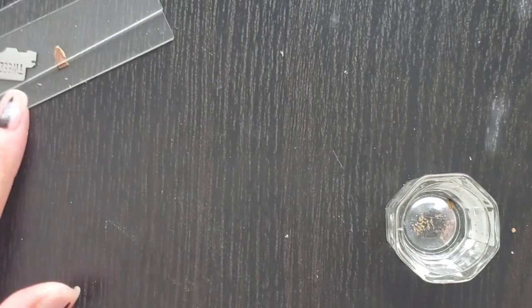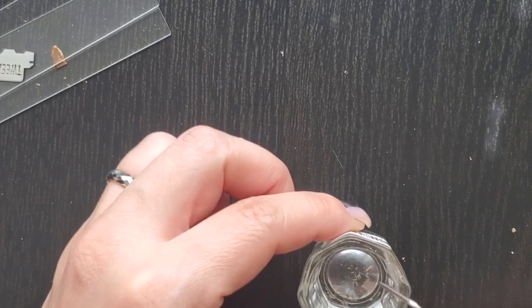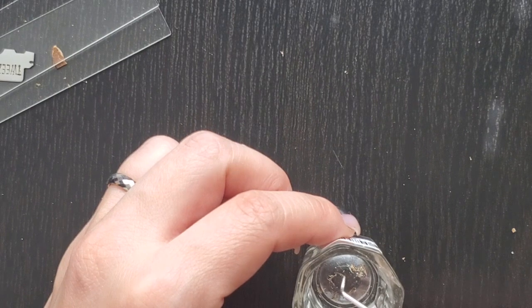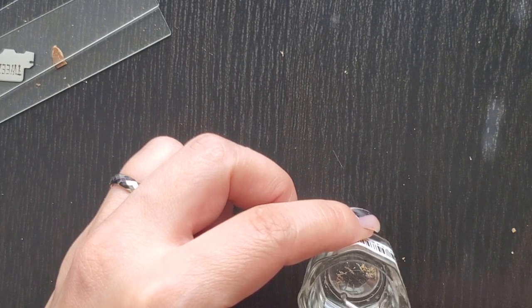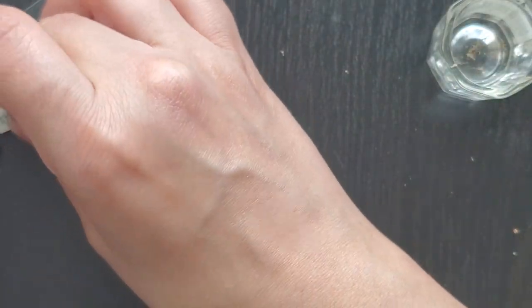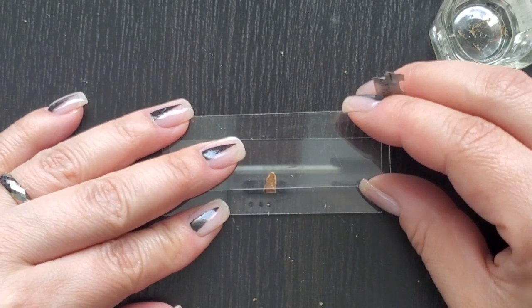All right, so I've done some. I'm not really happy with any of them, but because I'm kind of doing this quickly for the tutorial, I usually take a really long time to do this. So I can already tell these are huge sections because they're rather thick. So I'm actually going to try to do a little bit more until I'm pleased with what I have. I keep getting out of the camera because I don't know where it's pointing. Okay.